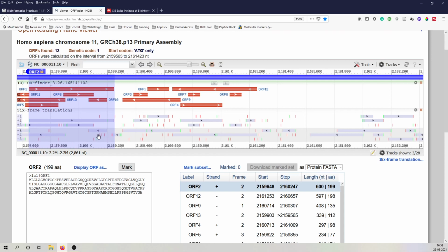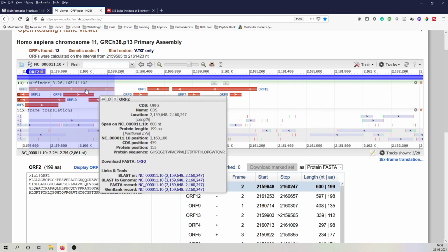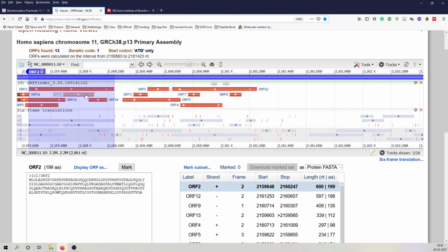And if you are reading this strand, these are the different proteins that are coded from that region. In the other regions it will encounter a termination codon, so that will not be coded for. So these are the fragments that are coded. This region of the gene is coding for some proteins. So that is the open reading frames.